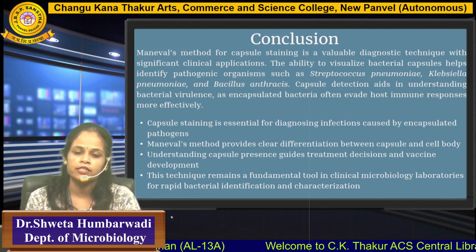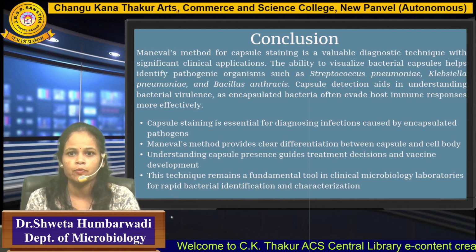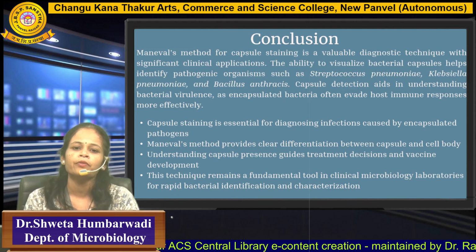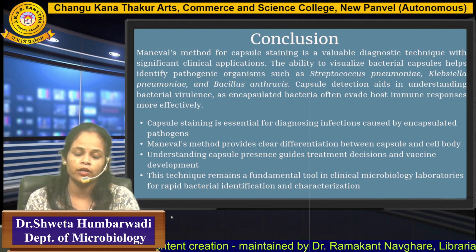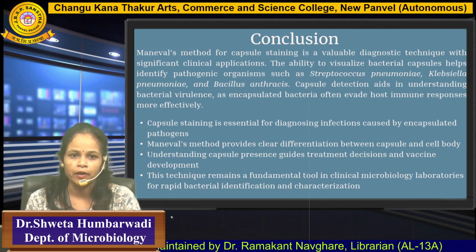So this capsule staining is essential for diagnosing infections caused by encapsulated pathogens. Manevel's method provides clear differentiation between the capsule and cell body. Understanding the capsule presence guides treatment decisions and vaccine development. If a capsulated organism is there, then we are going to use different types of treatment methods.